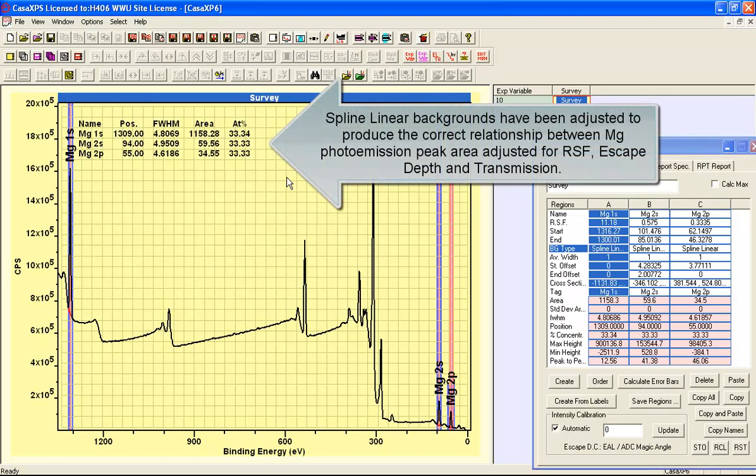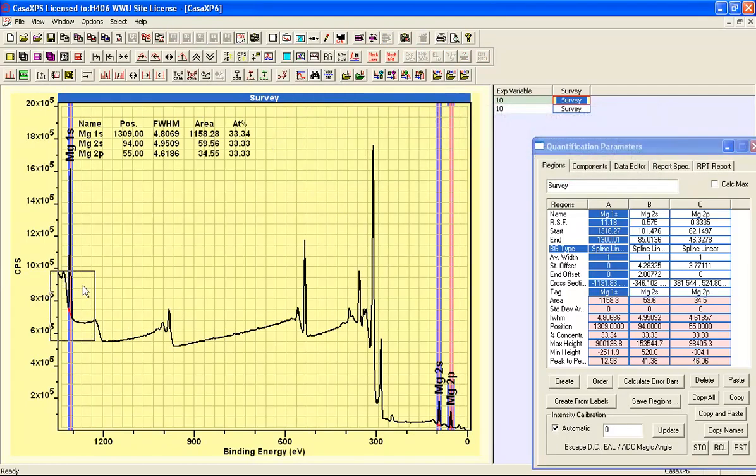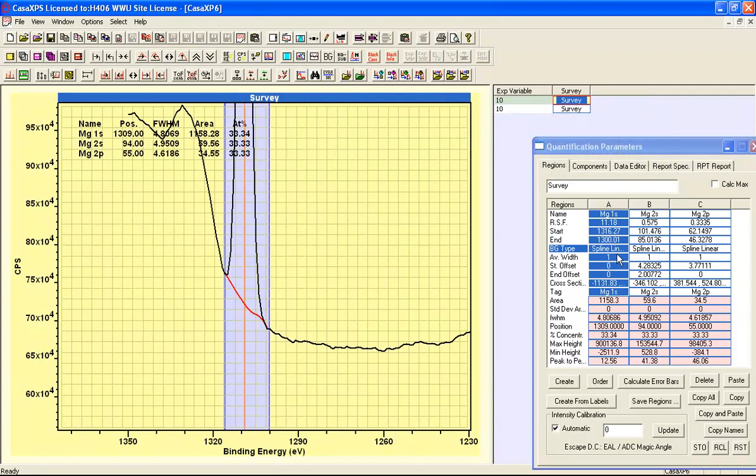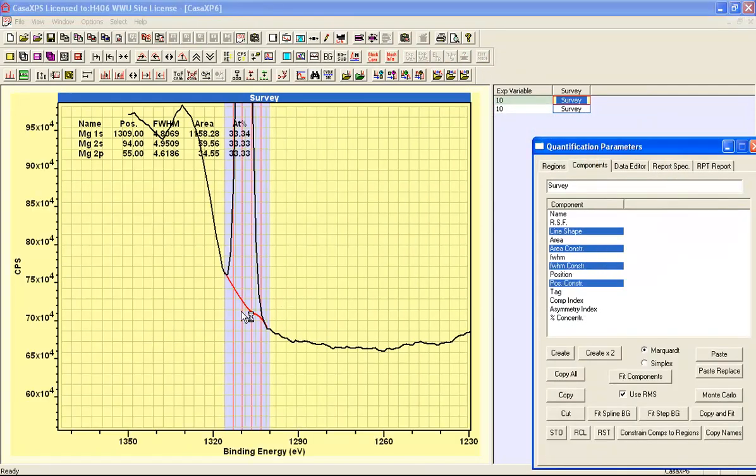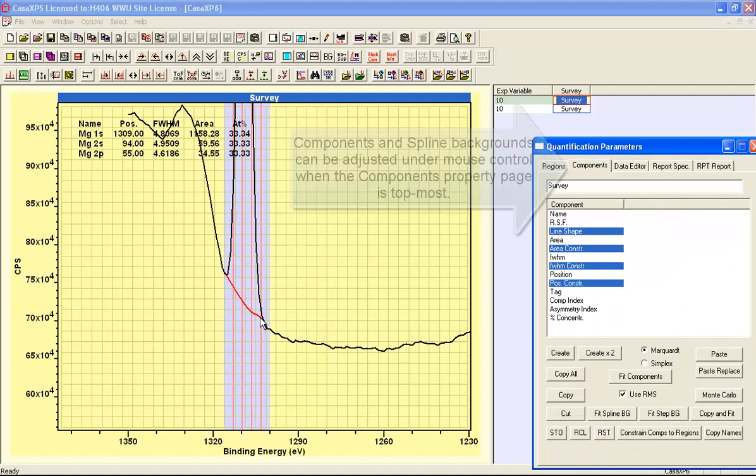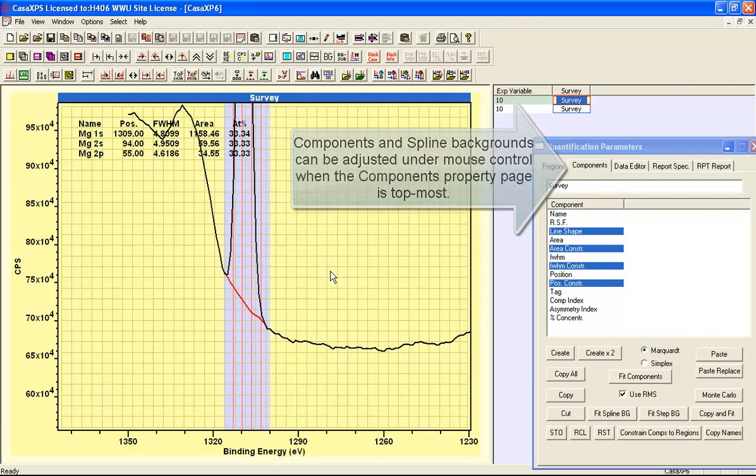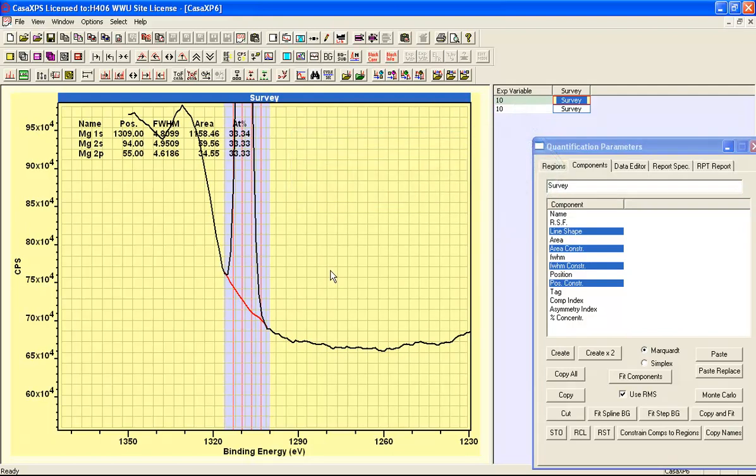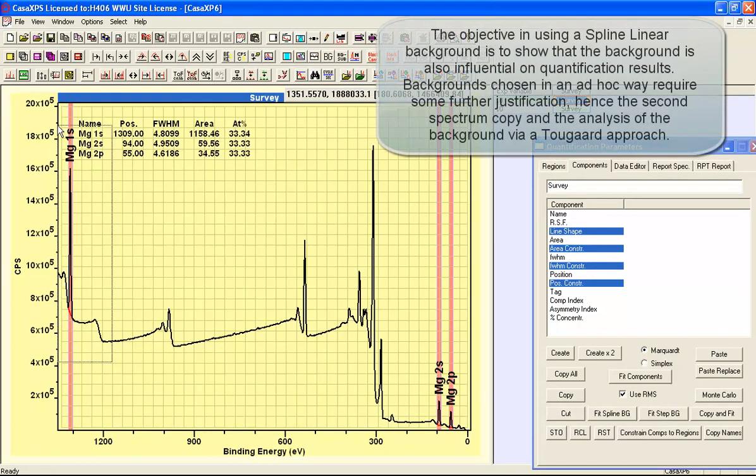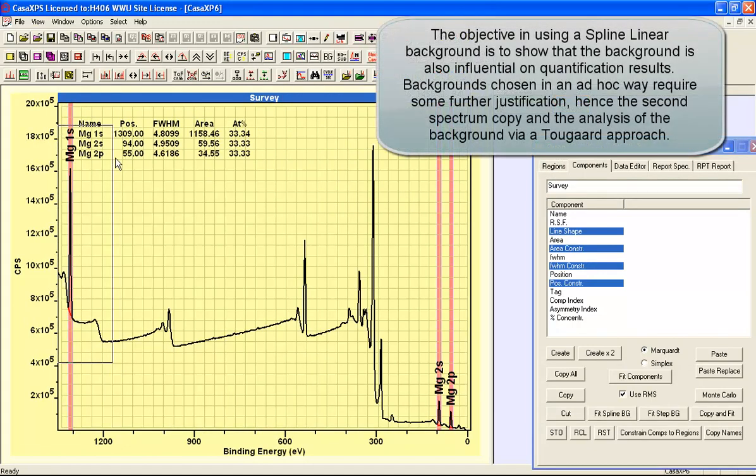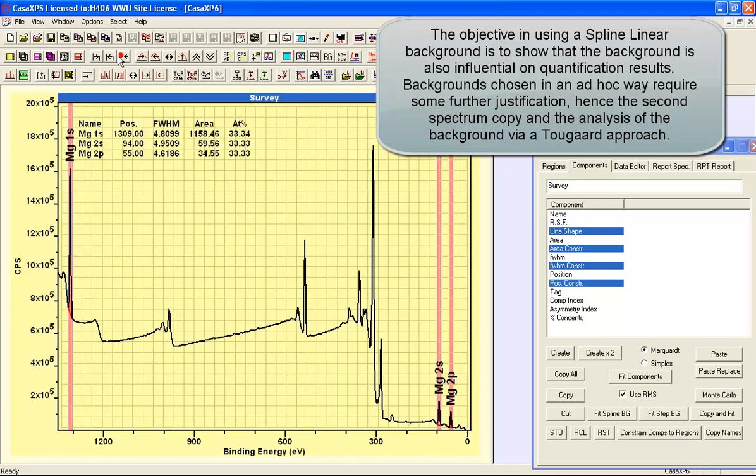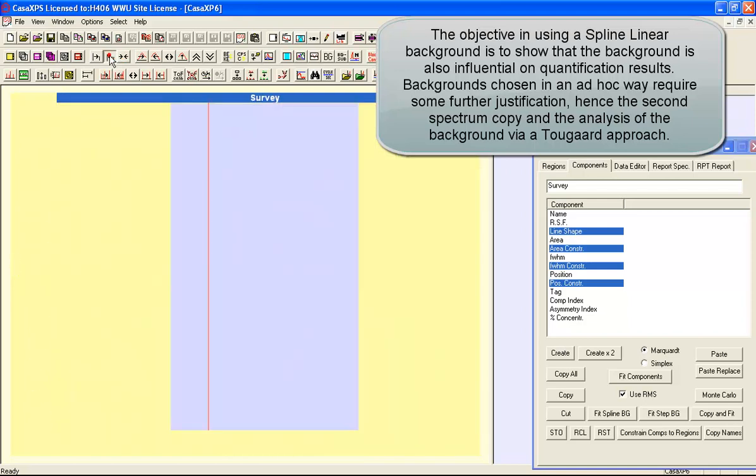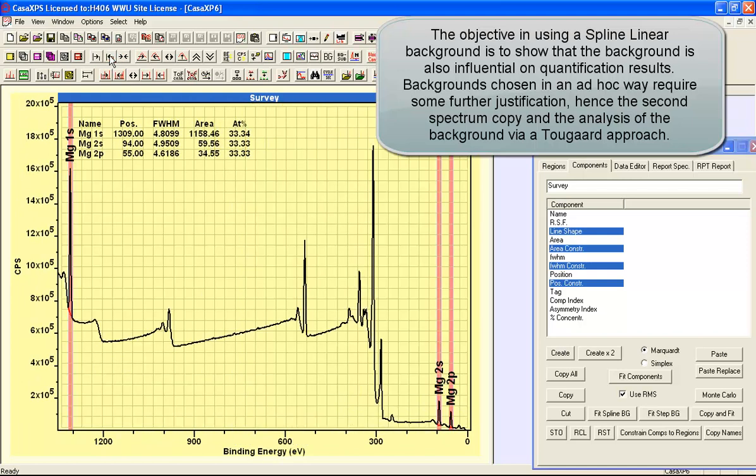And the first one has got three regions that have been designed using a background type which is a spline linear. And this allows you to make small adjustments to the shape of this background in order to adjust the background until you get something that is in some sense more reasonable given the quantification that we're performing here. So I've got three backgrounds, three peaks, and they each have slightly different shapes to their backgrounds.